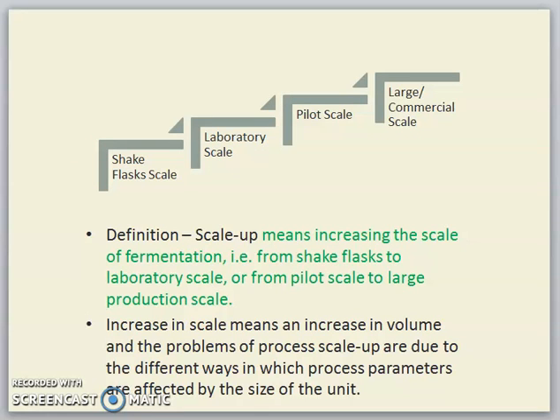Now, these are the stages involved in scale-up processes, particularly if we plan to produce a new product and we are unsure how the cell would behave. We have to start from the shake flask. In the bioreaction fermentation, we need to start with the shake flask, and this shake flask study is usually done in the lab scale. So when we have this shake flask, we know that we are in the lab scale stage.